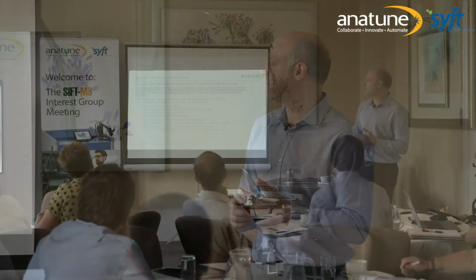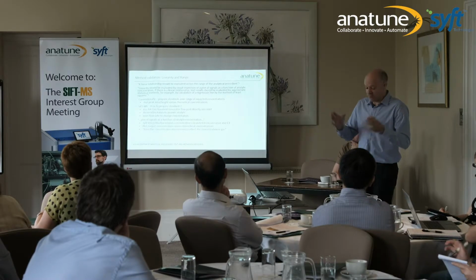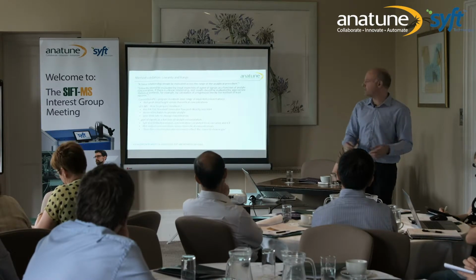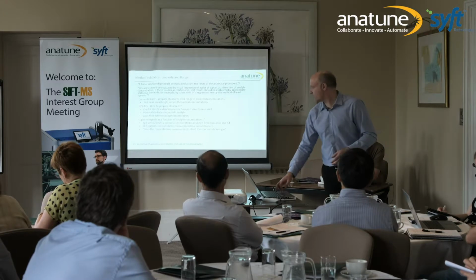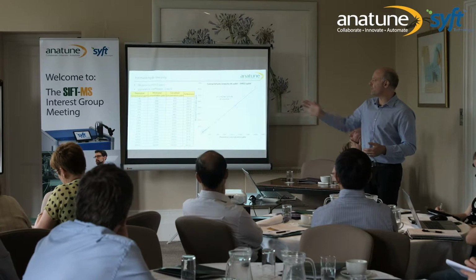So with a paraformaldehyde in an oven, passing gas across the permeation tube and running that gas into the SIFT-MS. And by changing the flow rate through the permeation oven, you can change the concentrations of the formaldehyde. So they generated linearity curves, basically, and range curves by using the full range of the permeation oven. And this was the first set of data they ran. So they ran it from about 100 ppbV up to 35 ppmV.